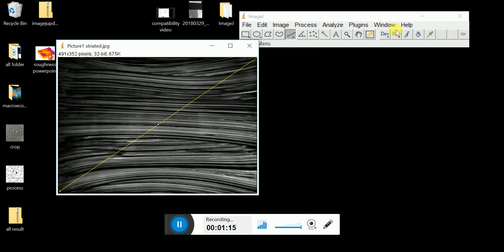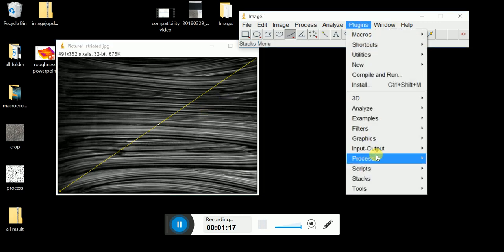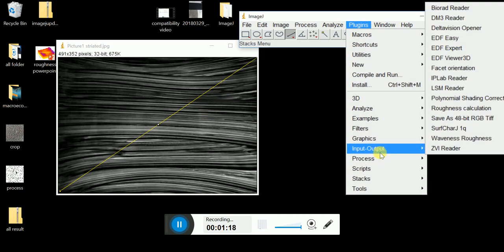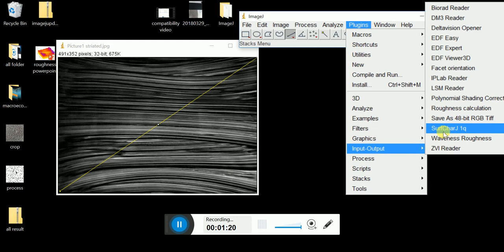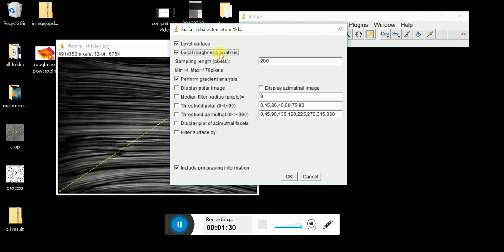After that, go to Plugins, Input Output, go to SURFCAJ1Q. From here you can see the parameters. Click Level Surface, Local Roughness Analysis.